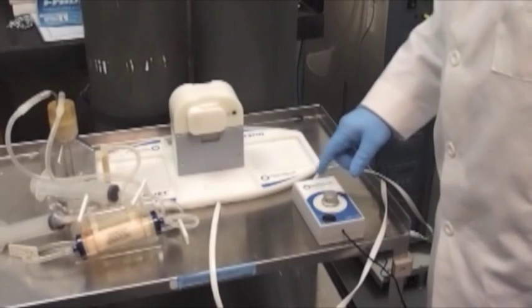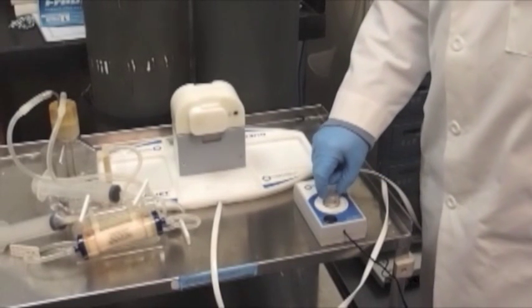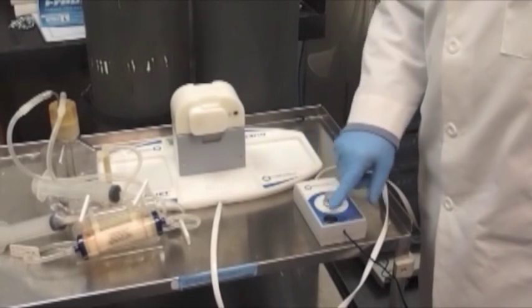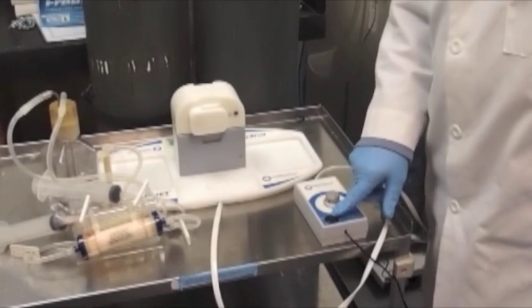We have the flow rate control box and the flow rate control knob, which adjusts the speed of the media recirculation through the cartridge, and an on-off switch.